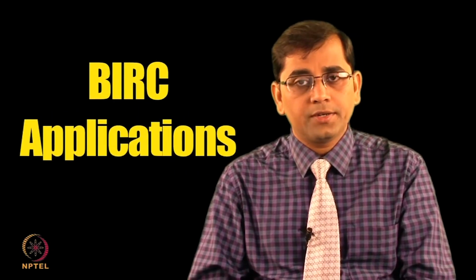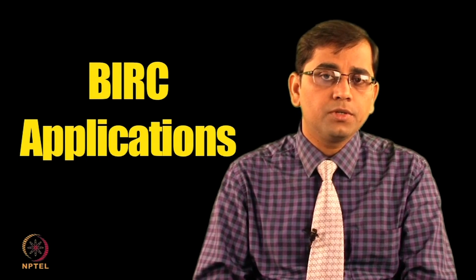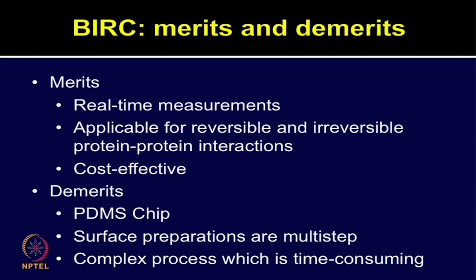BIRC has been applied for many versatile applications, demonstrating the power and versatility of the approach for detecting protein ligand interactions in complex environments. It is a highly sensitive approach which requires only a minute amount of material. This technique facilitates label free studies using very small picoliter volumes, with a potential to quantify binding affinities in a high throughput manner.